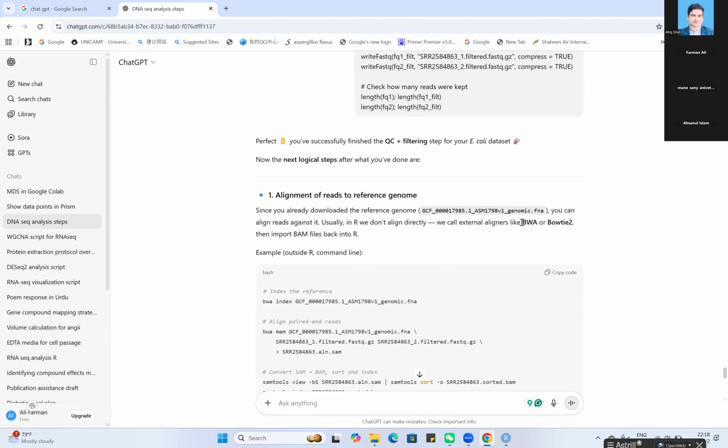Okay, now come to chat and write a message: Is there any tool in R for alignment of reads to reference genome?